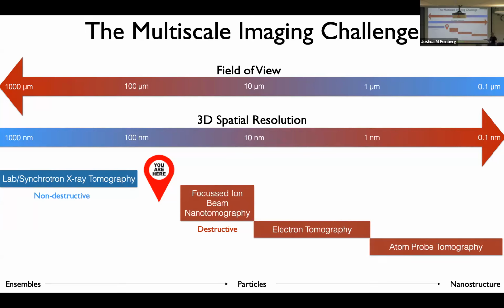So if you do 2D imaging, this problem doesn't exist, but you have another problem, which is if you do high-resolution images across a very wide field of view, you generate a lot of images, okay? That's a lot of data you have to deal with, quantify, and interpret. And that's where machine learning comes to your rescue, okay? You can't do this by hand. You need some way of automating this process, automating the acquisition of the data, automating the analysis of it. So that's the theme.